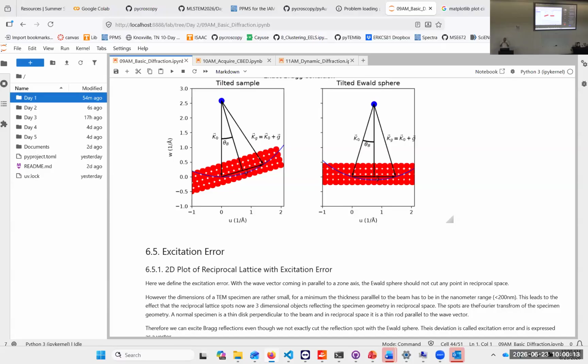So you go to the reciprocal lattice point in your diffraction pattern, you halve the distance, and it's perpendicular to that line. So that intersect is your Kikuchi line. You're done. You do the same thing with Holz lines. It's a little bit more complicated. I would refer you to my lecture if you want to know more about that.